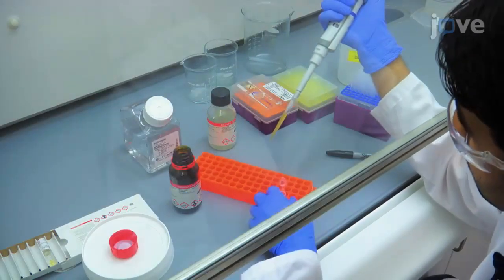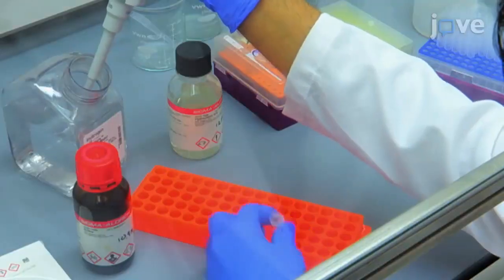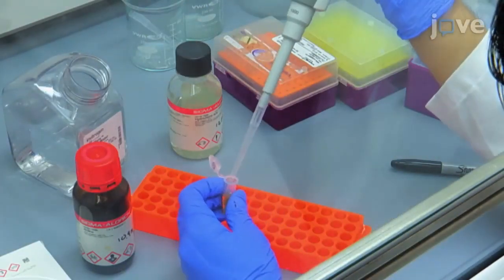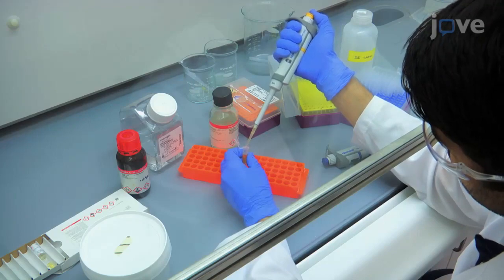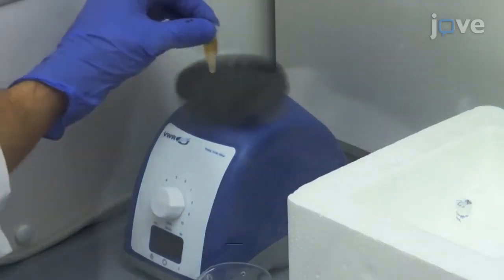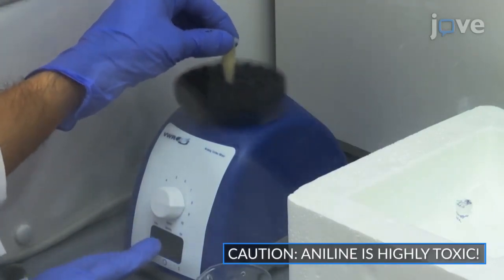Working in a hood, combine 550 microliters of the aniline with 337.5 microliters of LC-MS grade water and 112.5 microliters of 12 molar hydrochloric acid in a centrifuge tube. Vortex well and store the 6 molar aniline solution at pH 4.5 and 4 degrees Celsius.